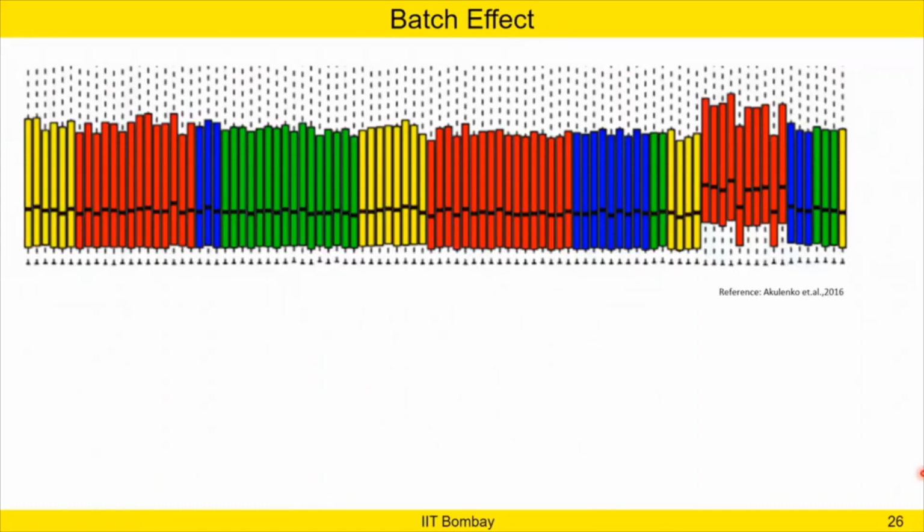So before proceeding, I just want to tell that I got many questions, and I get many queries regarding normalization and batch effect, right? So I must say that don't confuse these two things, the batch effect and normalization. Normalization is different and batch effect is different. So to make you a little comfortable with the term batch effect, I'm taking a reference figure from a manuscript, and I will try to show you how batch effect actually happens and what is the meaning of this.